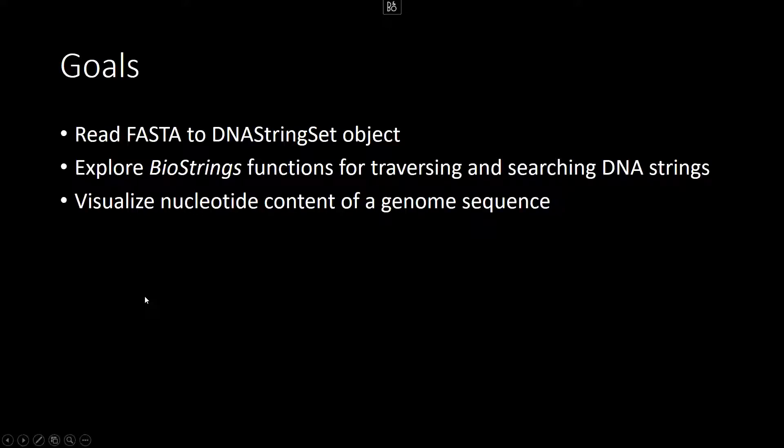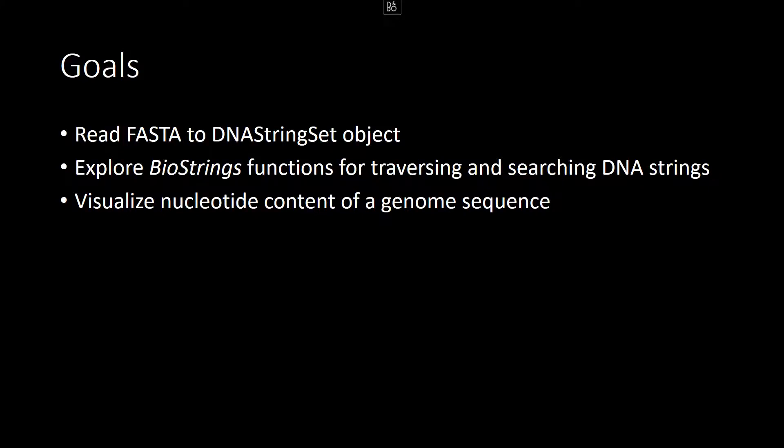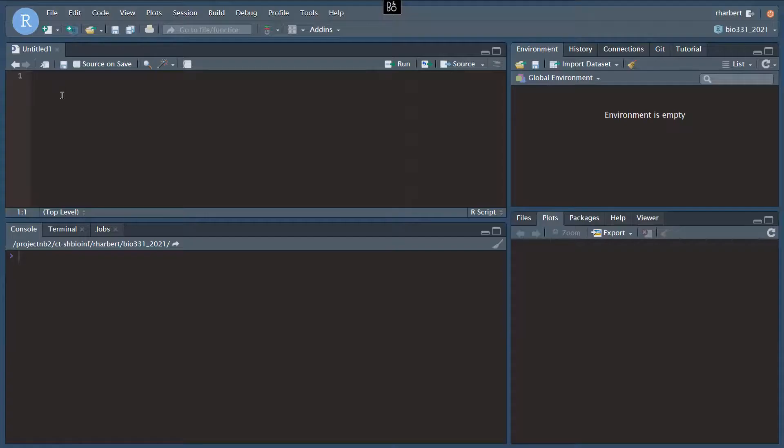In this video, we're going to practice reading in FASTA DNA sequence files into the DNA string set object. We'll take a look at how that object is structured, and then we will explore a couple of the Biostrings functions for traversing and searching through DNA strings. And then we will calculate and visualize the nucleotide content of a single genome sequence from E. coli.